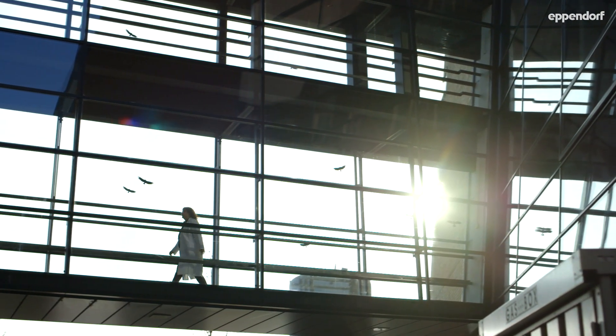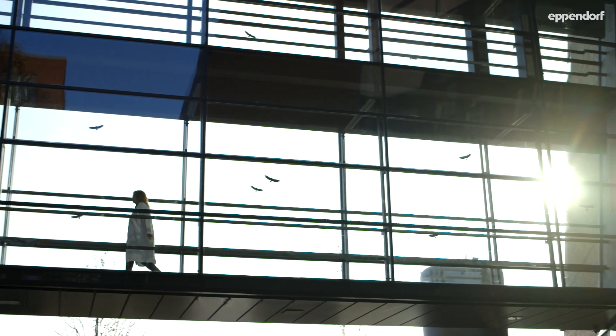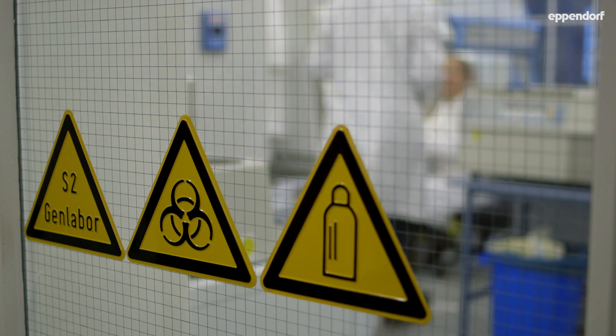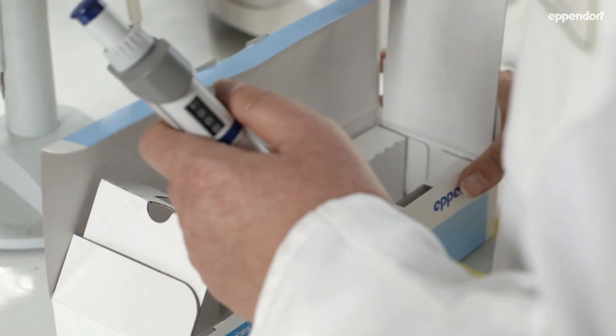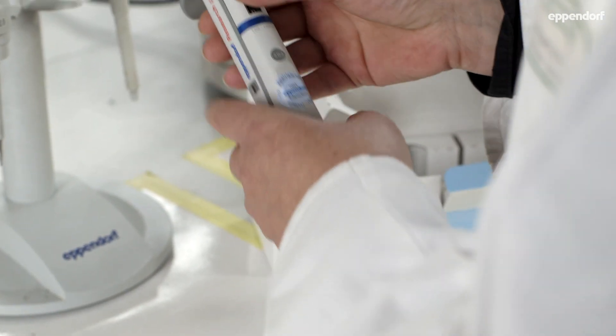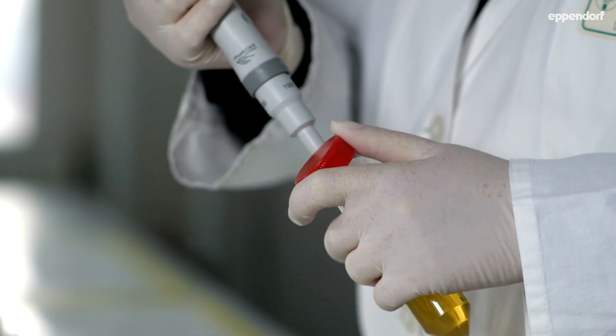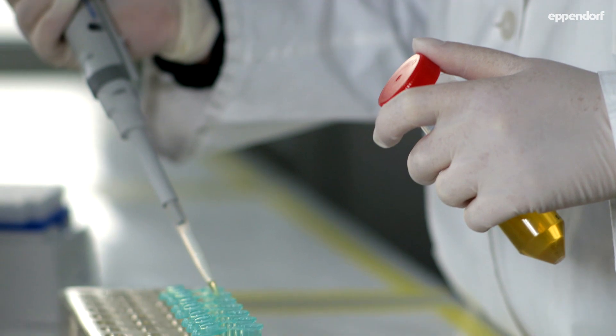I am Dorothea Zander and I work on the Leishmaniasis research unit in the Bernhard Nocht Institute for Tropical Medicine in Hamburg. Currently, we are working on the identification of novel anti-Leishmania drugs. We only use regularly calibrated pipettes. Giving the pipettes to the Eppendorf service gives us safety for our research.